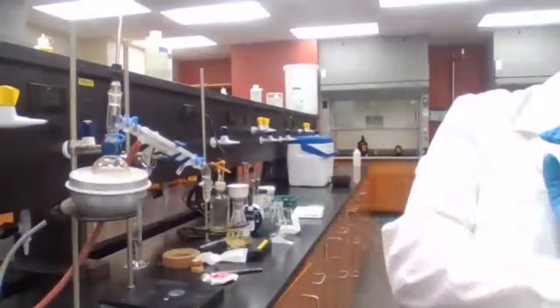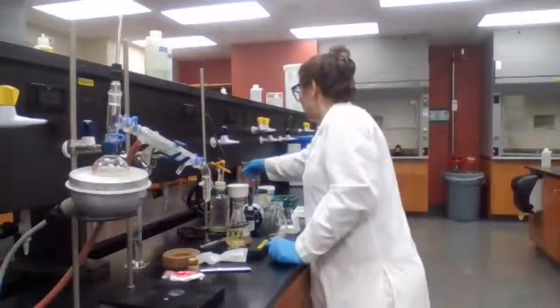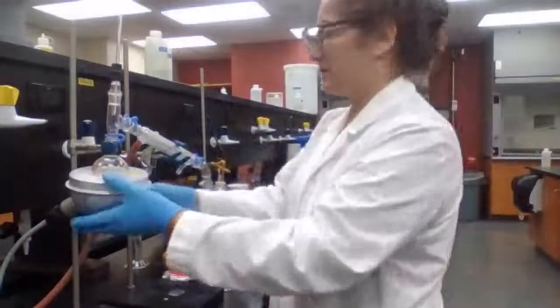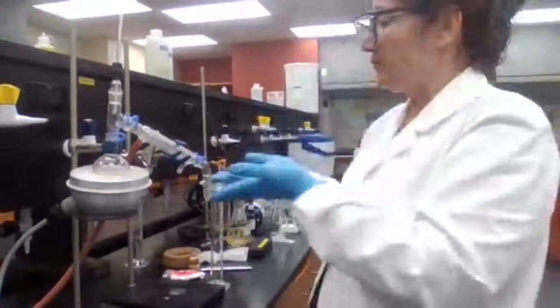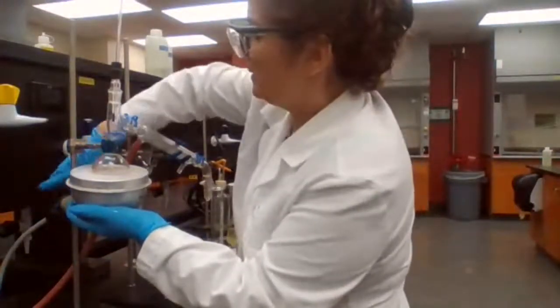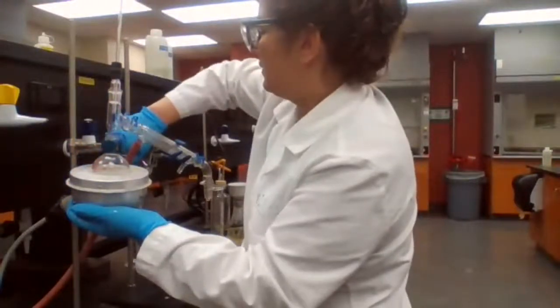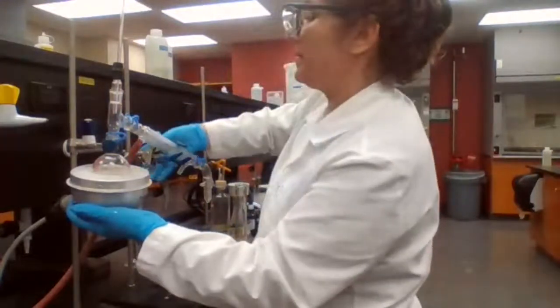Go to page 23. Okay. And we want to collect about 35 milliliters. You see that it doesn't fit underneath. I have to lift the whole thing up. Usually when you have two people in the lab, it's easier. Each person is going to hold one piece of the glass or one clamp and bring it up.